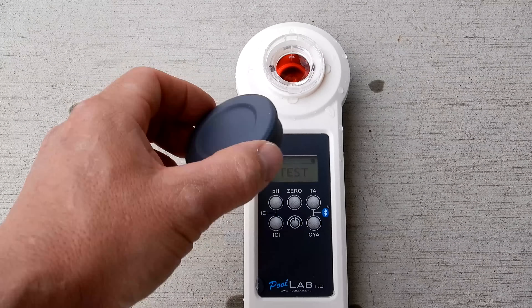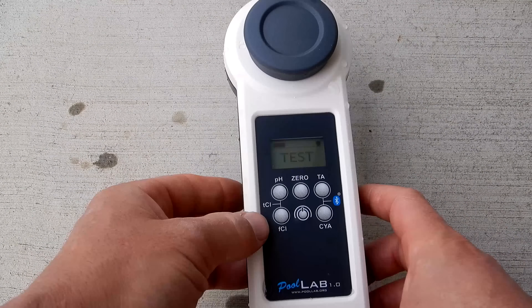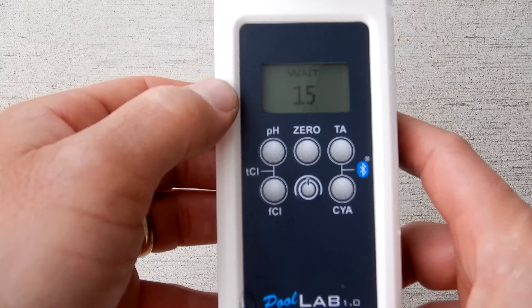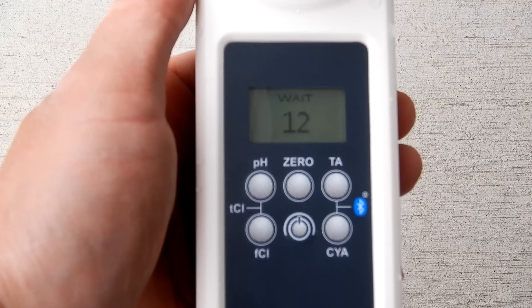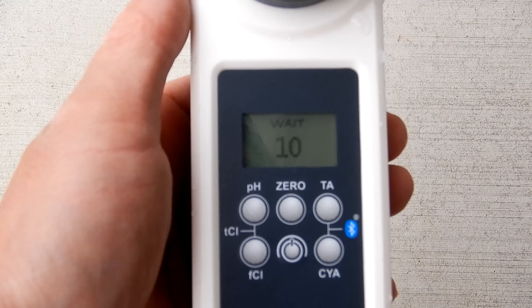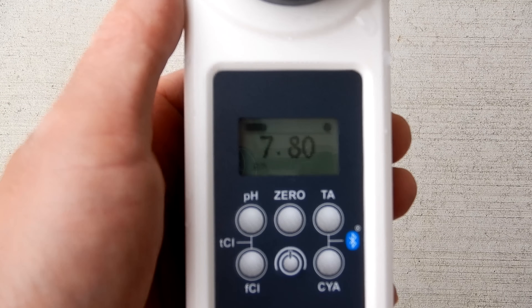Now you want to cover the water sample with the cap. Since we're doing pH, I'm going to go ahead and hit the pH button right here. It'll count down, then it'll give me the pH reading in this pool. The pH reading here is 7.8.